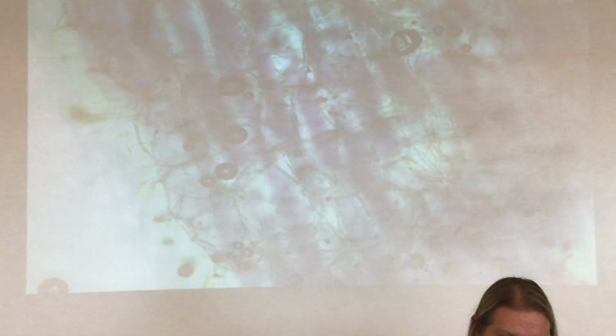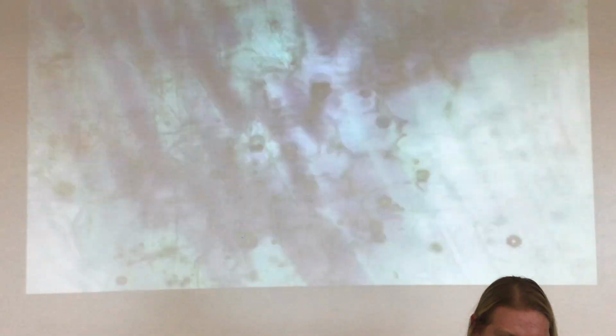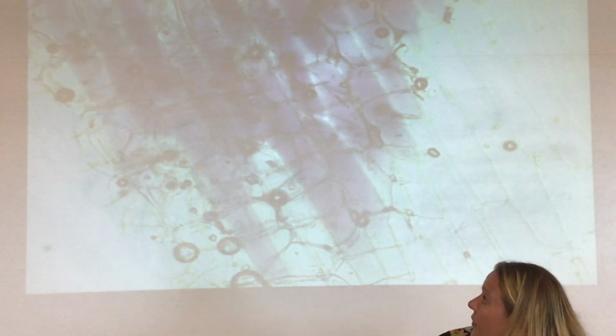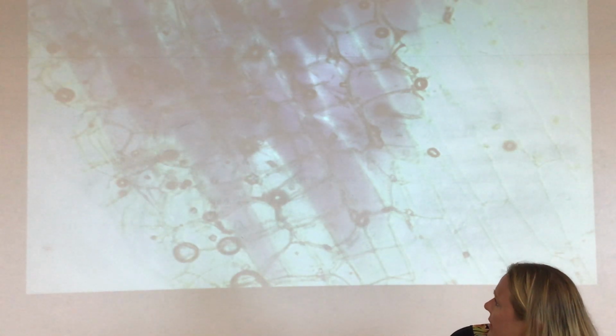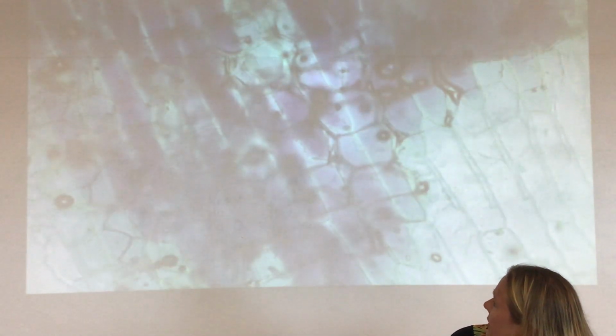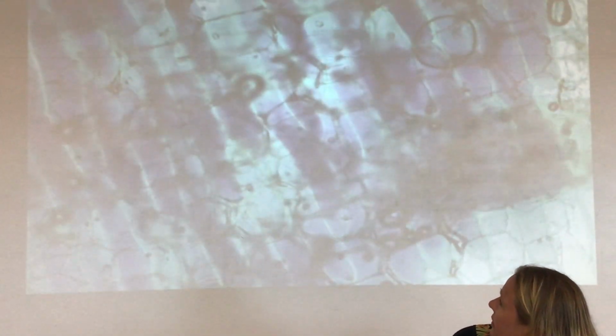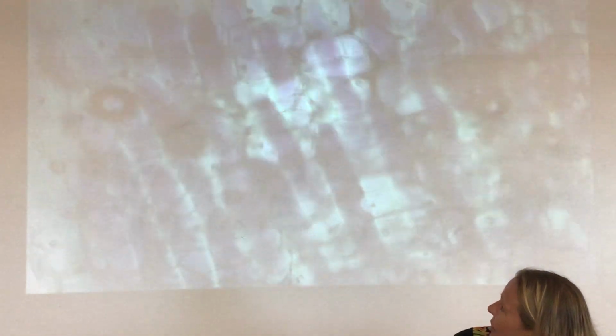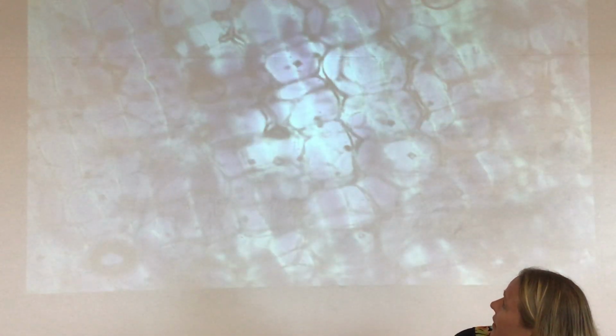They're on the slide. All right, I'm gonna go right here. See if I can focus on that one. Not coming in quite as clear as I want. Bear with me as I find a good one. This isn't something that you can plan. You just put it on there and then you find one.